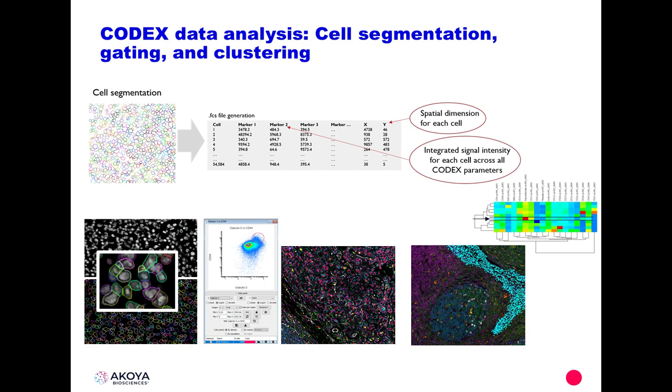We can create populations and identify populations of cells using a couple different strategies. One of those strategies is to use a flow gating strategy, shown here, where we can identify populations in the tissue while we gate them. The other strategy is to perform clustering, where we cluster the data and then identify cells or populations using those clusters.